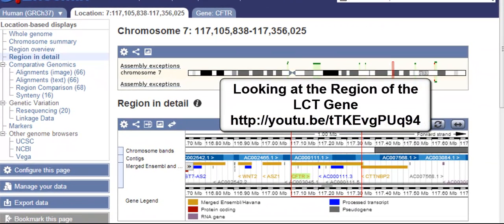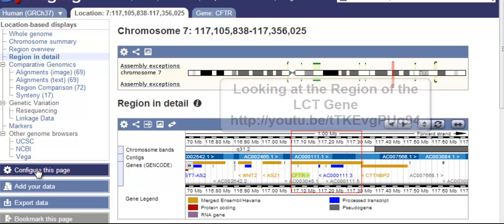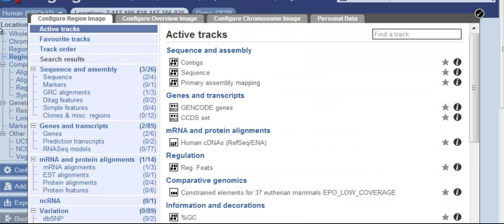You can turn on many different types of data along the genome. If I click configure this page, I will be able to turn on different data tracks.